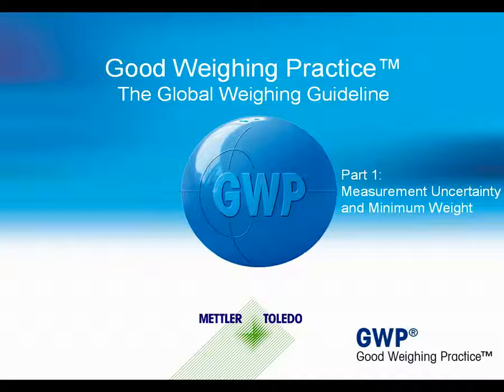A second webinar will be focusing on another important part of the life cycle management of weighing systems, on routine testing. Routine testing will be briefly explained in the framework of the Introduction to GWP in this webinar. However, more thorough information will be provided in the second webinar.